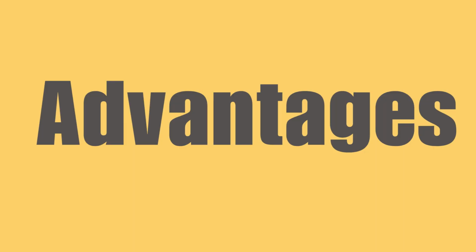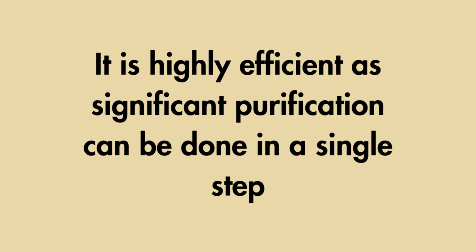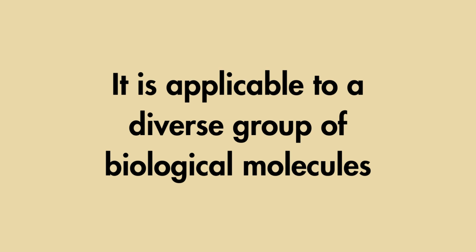Affinity chromatography has high specificity for selective purification. It is highly efficient as significant purification can be done in a single step. It is applicable to a diverse group of biological molecules.